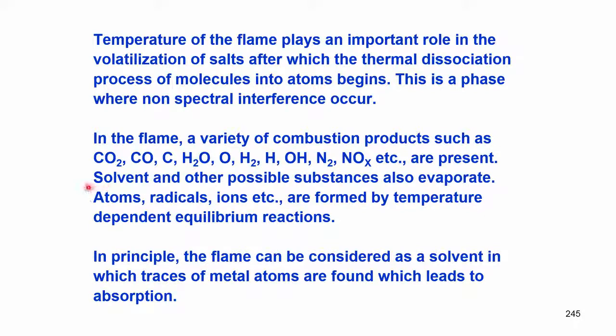So, suppose you extract the sample in a solvent, then the solvent also will get into the flame and other possible substances present in the sample also will evaporate. For example, if you want to determine gold in sea water, then what happens?